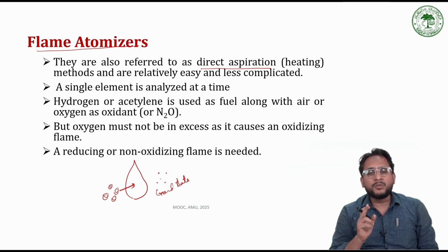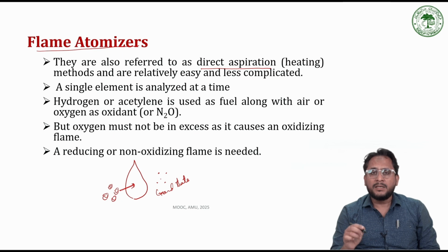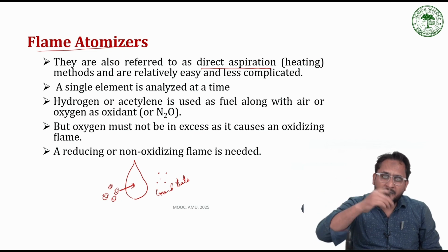But here in atomic absorption spectroscopy, the job is to convert the liquid sample into aerosol, and from aerosol we convert the sample into dry vapor molecules, and then those molecules into individual atoms in vaporized state, and those atoms should not be in their excited states. The atoms should be in their ground state, so that with the help of light they are excited.